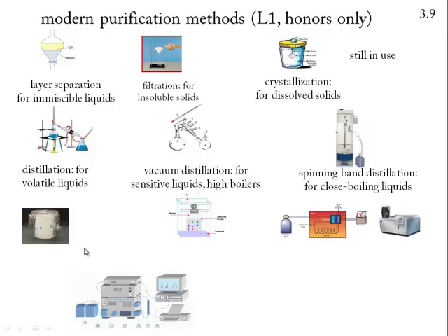Let's imagine you have a mixture of many solids dissolved in a liquid. You can't really crystallize it because they're going to crystallize out as mixtures. It won't really work. They'll probably be amorphous. And so a method for this can be to use chromatography. Now this is paper chromatography here, and almost nobody uses that on an industrial or a preparative scale. It's fun, and it demonstrates the technique, but it's rarely very useful.